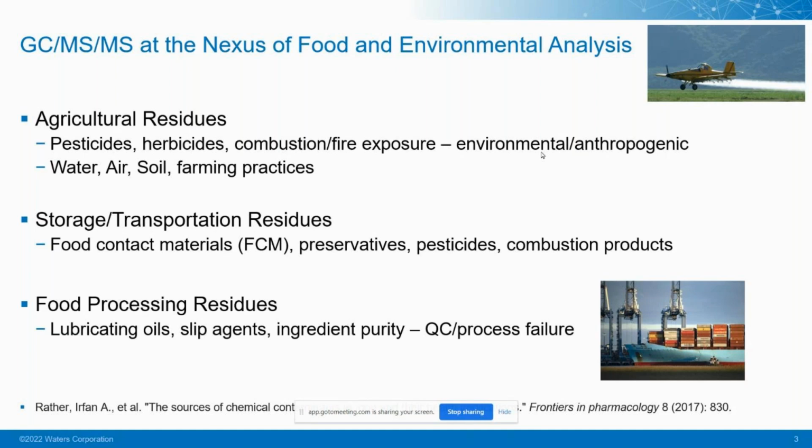If we look at it from the food context, we have additional pesticides that might be applied to storage areas during shipment and storage of food materials. The food contact materials themselves, inks, dyes, and plastics that might be in touch with the food product. And all of these can lead to a need for broad characterization of analytes in a huge range of matrices as well. The connecting factor across all of these is often the negative effects on human health of these various compounds as they go through the different compartments in the environment or through different food storage and production issues.